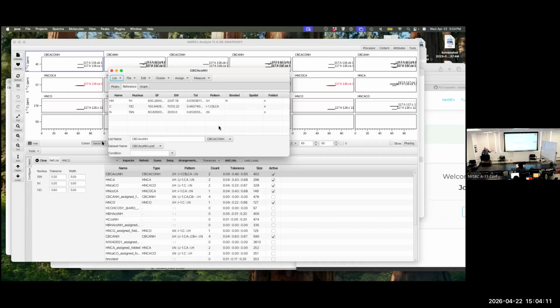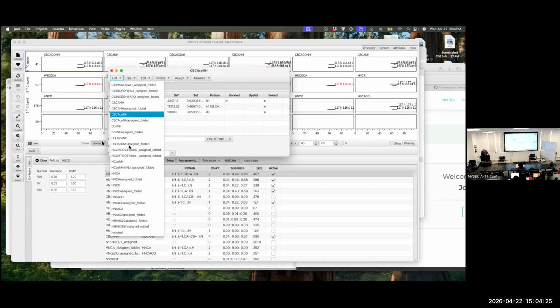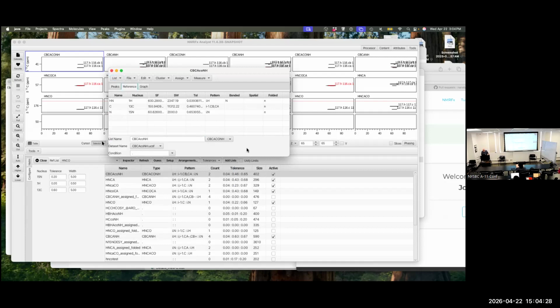And mostly, if you open up a data set, you can just click from a list of choices here and select the correct name, and it will then populate these. You're going to avoid having to type. Let me go to one, which is a little.